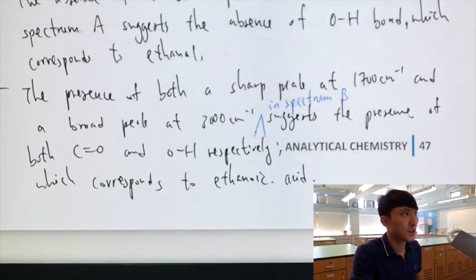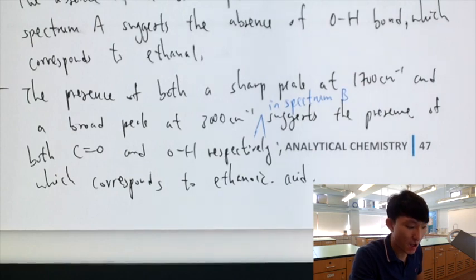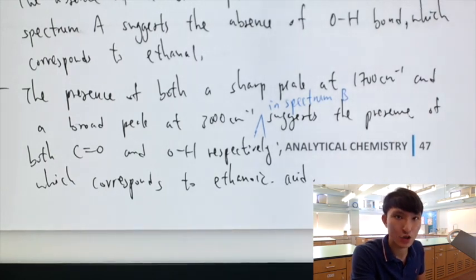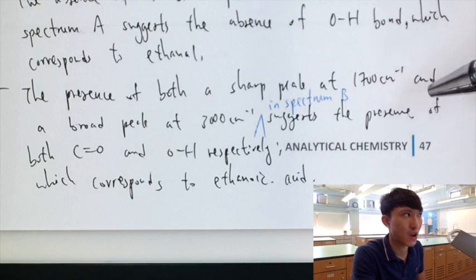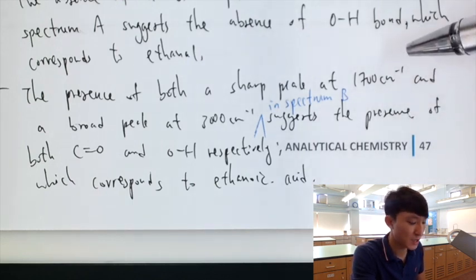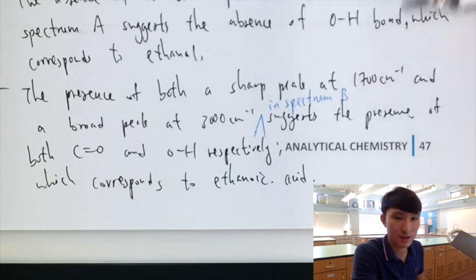Okay, so this is to show you two ways of making the assignment, and to be honest, there are many other ways to do the assignment. Because we are trying to sort out 3 items for 3 spectra, in our reasoning, all we have to do is put down two assignments in order to sort them out.